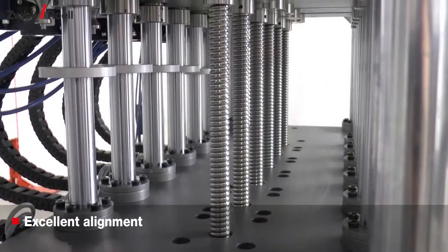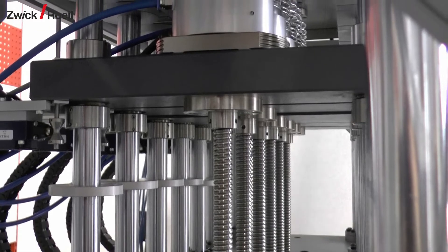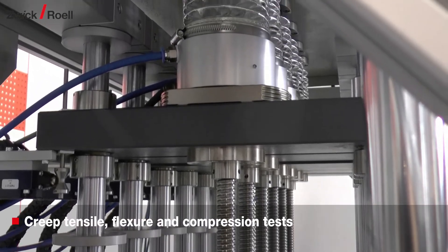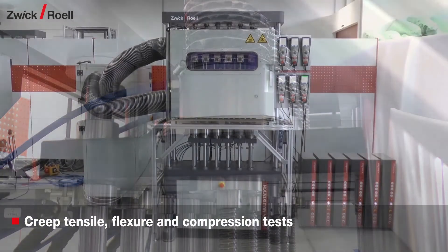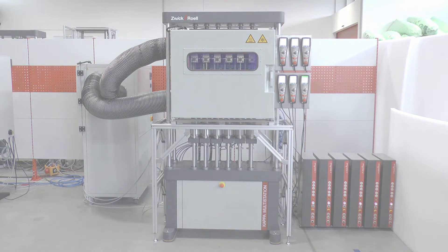The central lead screw design for each station provides excellent alignment. It moves the crosshead with the load cell on top of it. In addition to creep tensile tests, the Kappa Multistation can be used to perform creep flexure and creep compression tests.